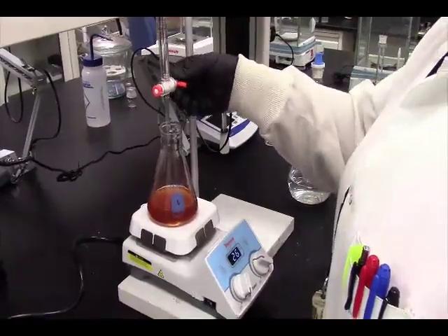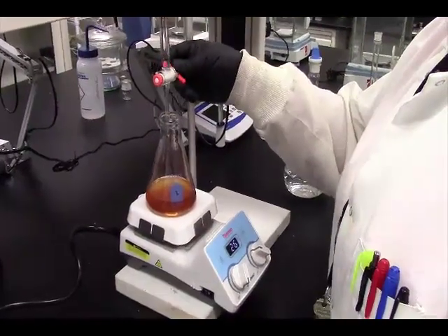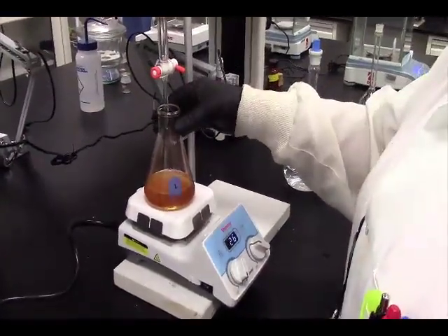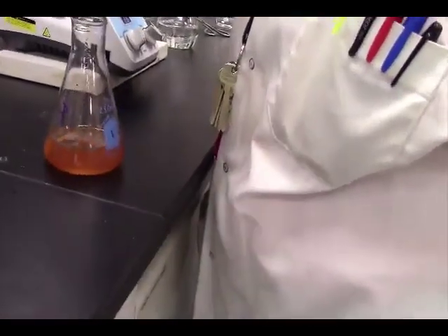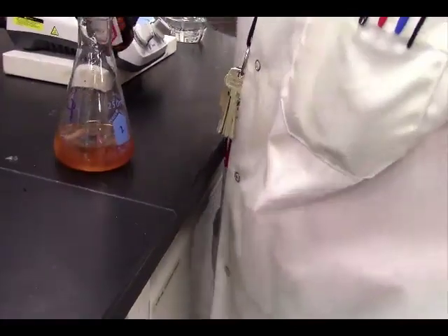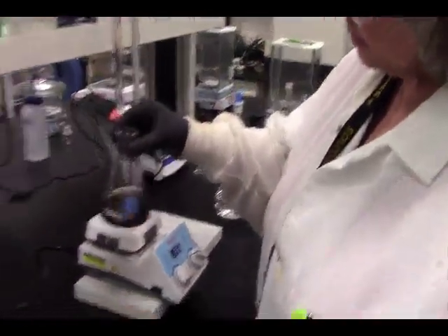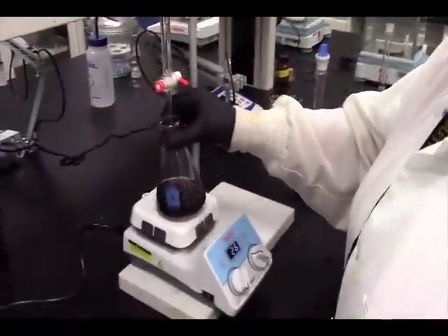We're at 13. Let's get a little bit lighter. Yeah, let's put our indicator in there. For some reason, this leaves a little cast of an orange. So we're stopping a little bit before.